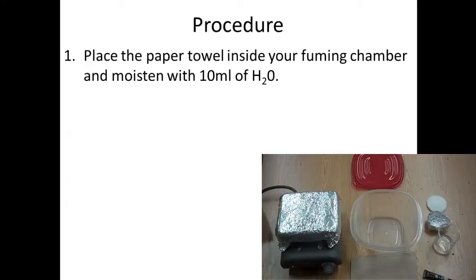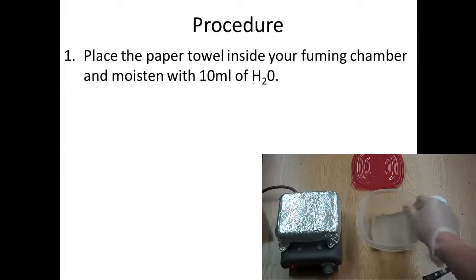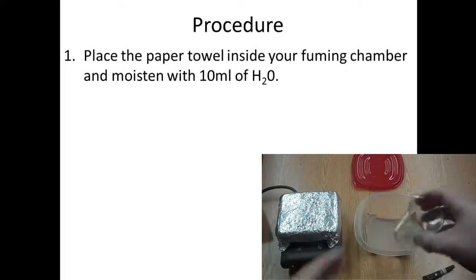So what do we have to do first? I want you to go ahead and place the paper towel inside the fuming chamber and moisten it with the water. This is going to create a vapor when we add heat to it that's going to accelerate the process.